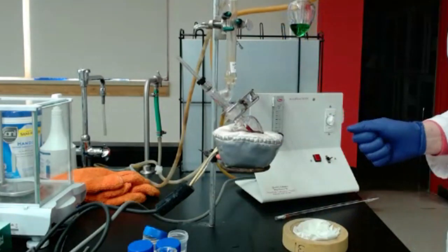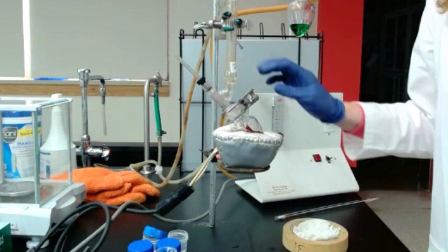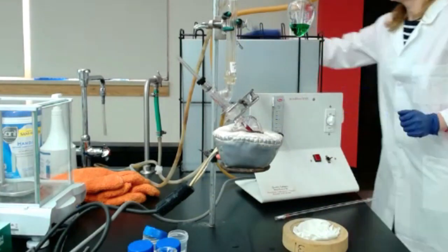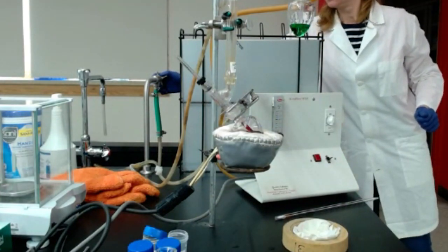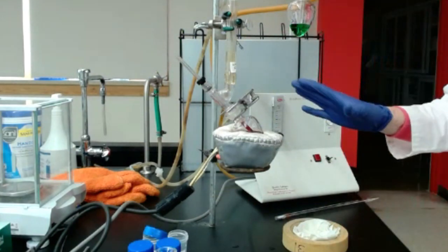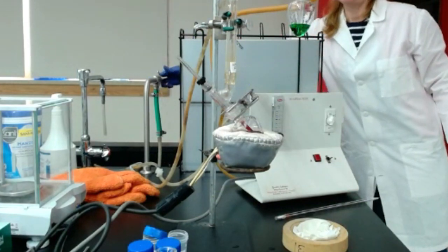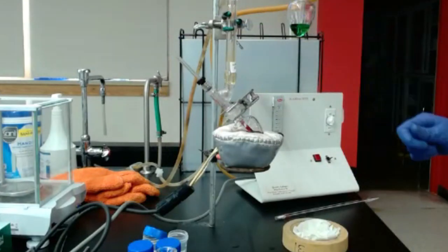All right. So this is heating. If we heat, that means we need to have some water running through just to cool down everything. So I'm just going to start the water. You might have a leak somewhere, but make sure you don't have a leak anywhere in your system here. The water should go from the bottom and back to the top. So from the bottom and goes to the top.